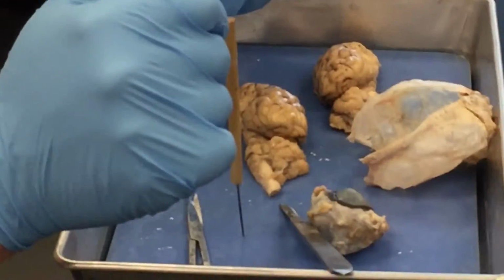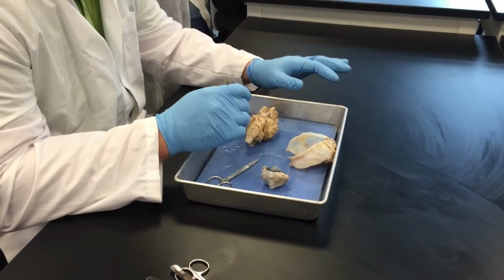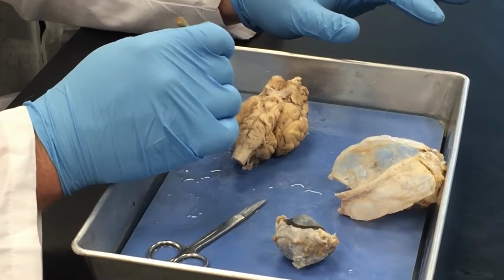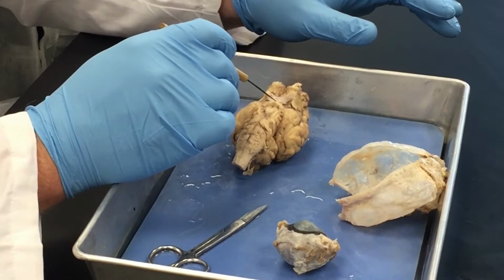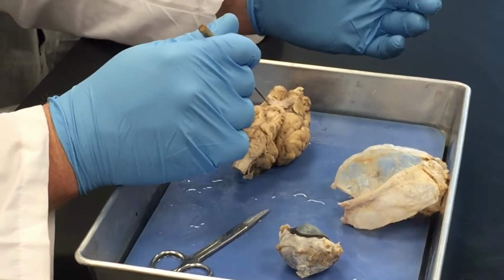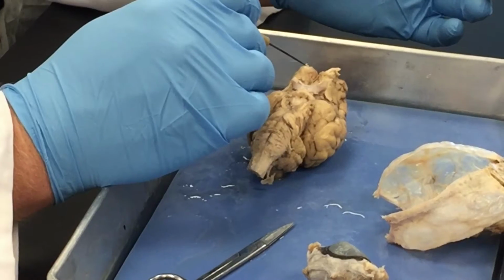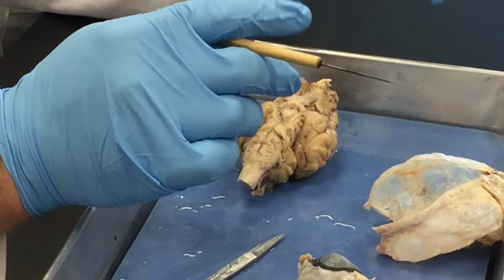So that's the brain. Cool. So, spinal cord, medulla oblongata is first bulge there. Pons is the next bulge, and the midbrain. So those are the three parts of the brainstem. Okay. Temporal lobe, optic tract, chiasm, and nerve. So nerves go to the eyeballs, they come together into the chiasm, and the tracts go back into the brain. Olfactory bulb and olfactory tract. See, this bulb right here has been ripped off. Okay? So that's most of what you can see from the underside of the brain when it's still intact.